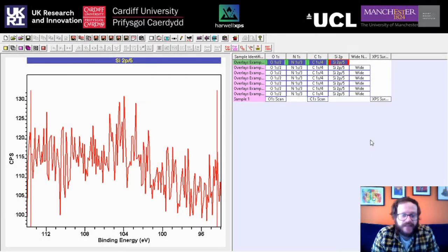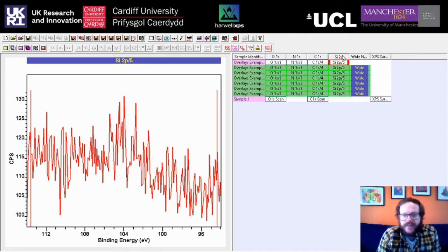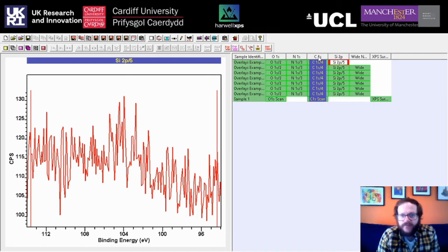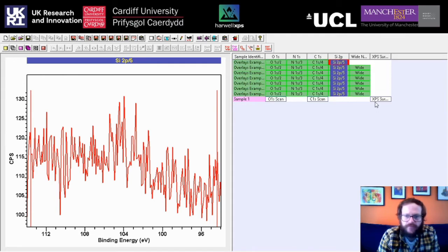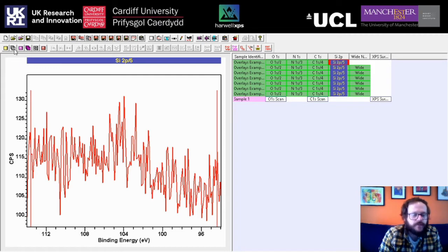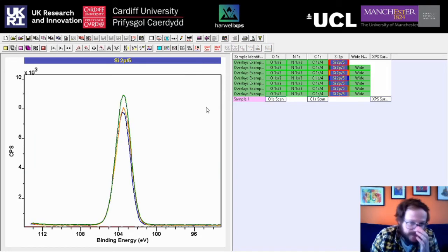Now we've got all of our data in a single file, let's go through some of the ways you can visualize, contrast and compare samples. These column headers let you click on any of them to select all the VAMAS blocks associated with that element — for example, Silicon 2p or Carbon. The same applies to the samples themselves: clicking on the sample name selects all blocks associated with it. To overlay all the silicon peaks, there's an option called Overlay (or press F2) that will display all samples in a single window.